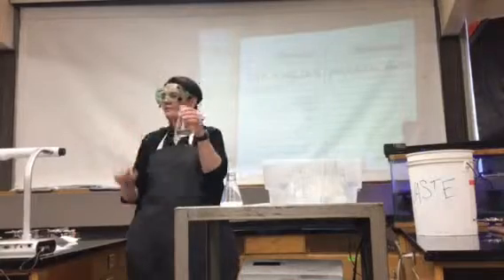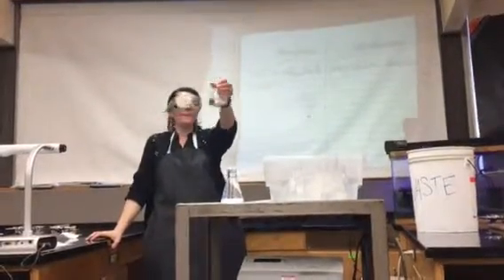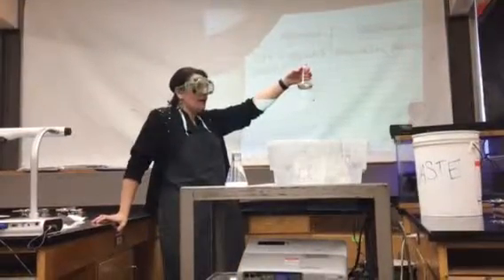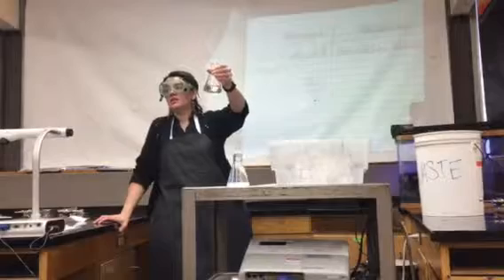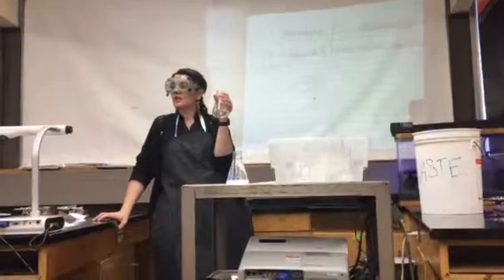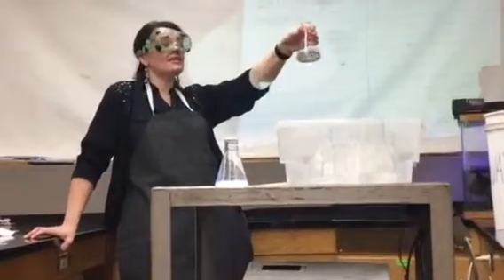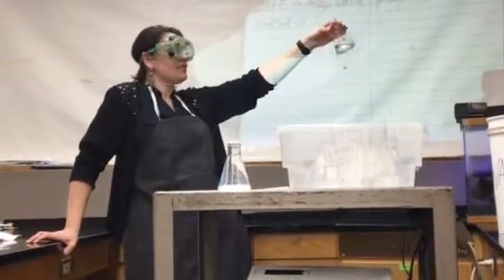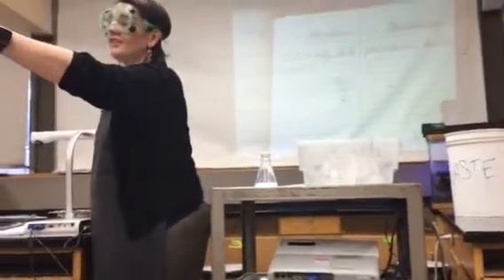Did that white stuff disappear? Is it in there still? No, I can't see that. Yes, it is. It has to be, right? I didn't take it out. So what happened to it? It dissolved again. So whatever A is made it dissolve again because it's clear. It's pretty clear again, right? There's hardly any evidence of it at all.